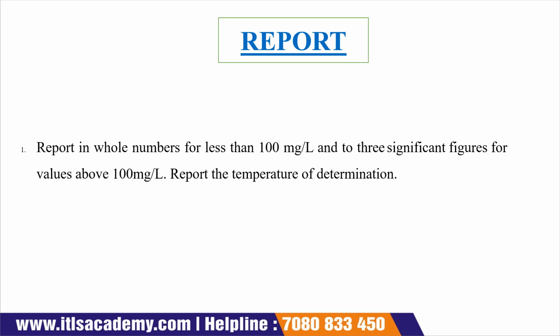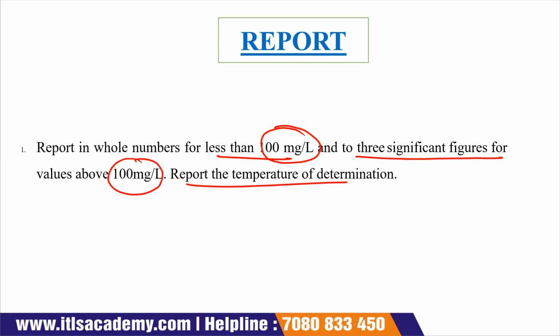Now report in whole numbers for values less than 100 milligram per liter, and 3 significant figures for values above 100 milligram per liter. Report the temperature of determination. So this is all about the determination of total solids.